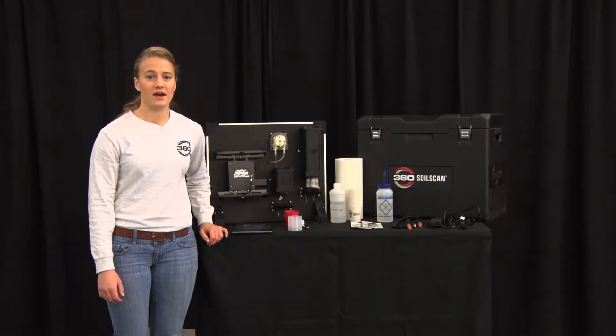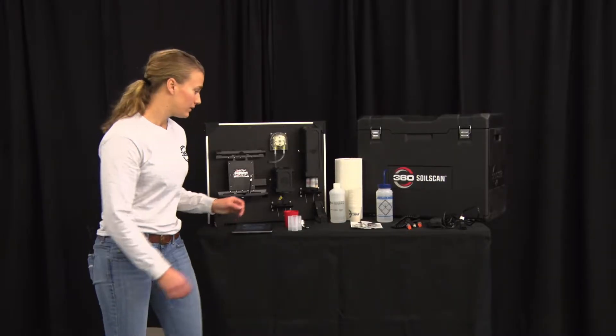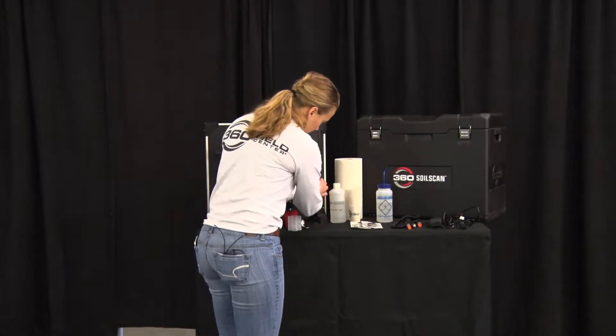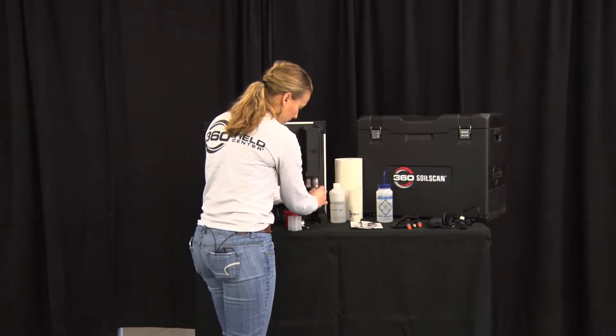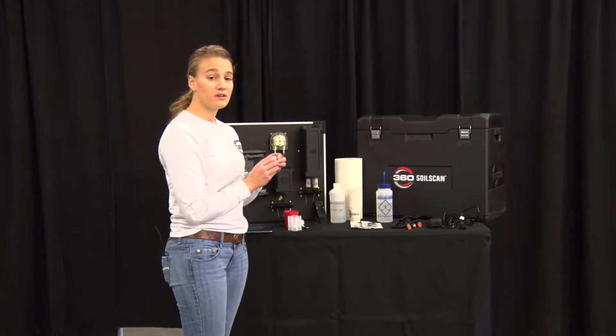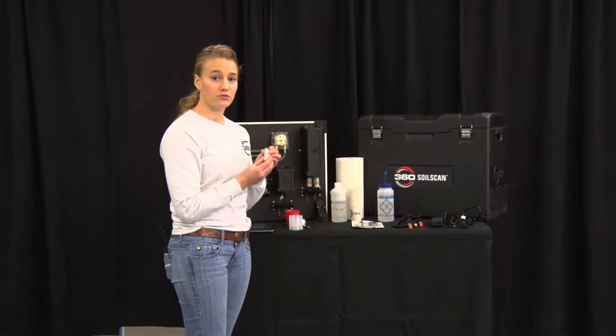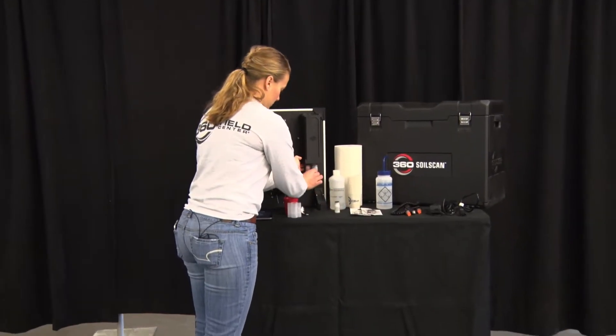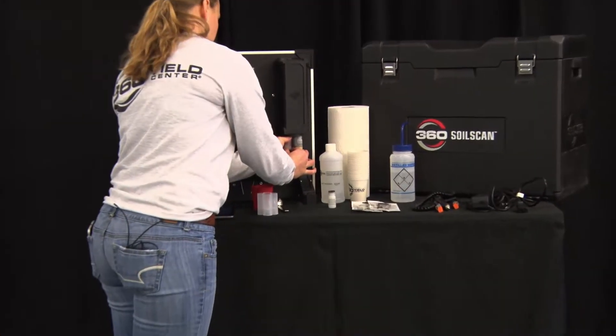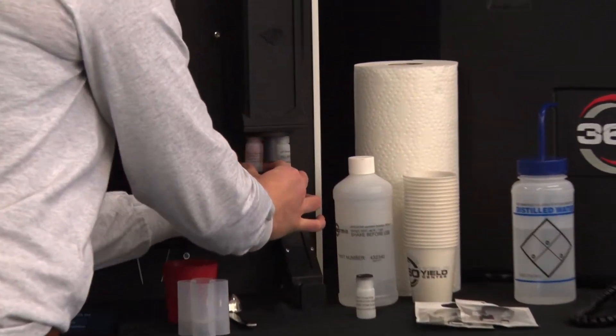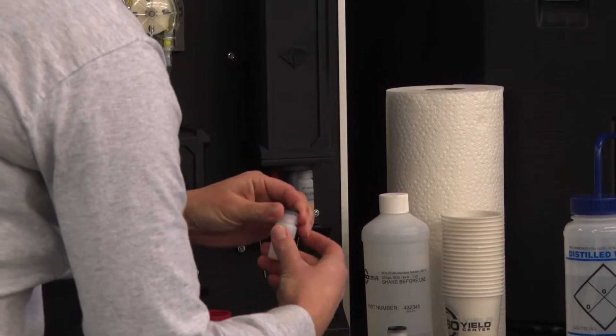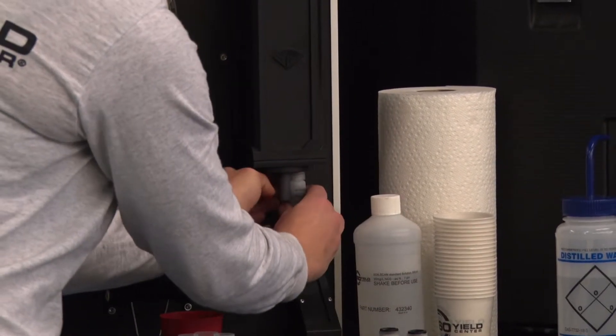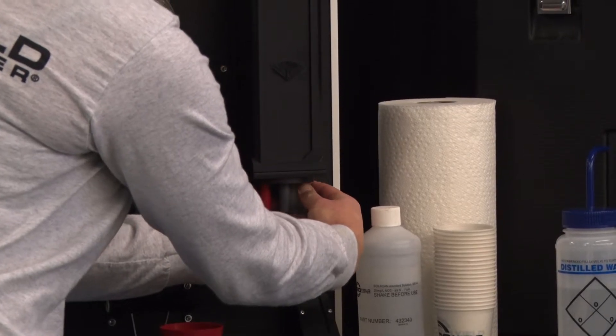If you're taking your SoilScan out of long-term storage you'll need to remove the long-term storage bottles. You do this by unscrewing the bottles and then sliding them off of the sensors. It's important to note that the gray nitrate sensor is stored dry. The red reference tip is stored in nitrate solution. And the black pH sensor is stored in nitrate solution as well.